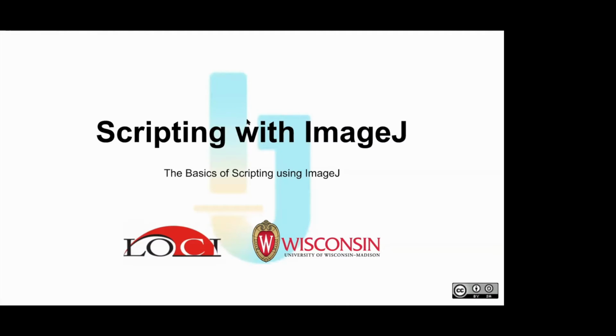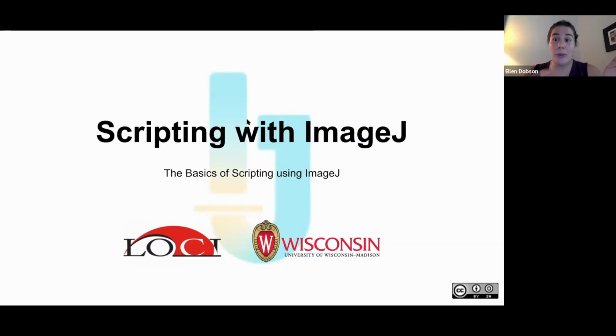Yeah, thank you so much. That's why I always personally duplicate my images as I build pipelines, because not only can some commands not be undone, but you can always get back to that original data that is completely untouched. You don't want to mess with that original image, but you can save everything subsequently.